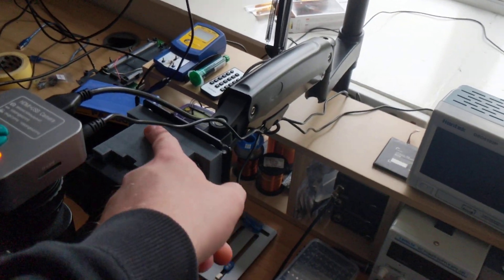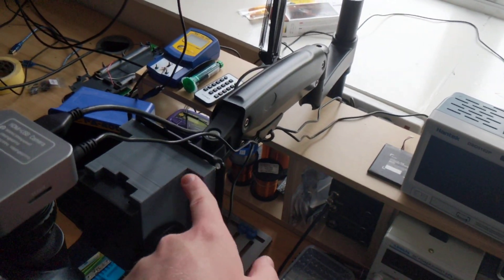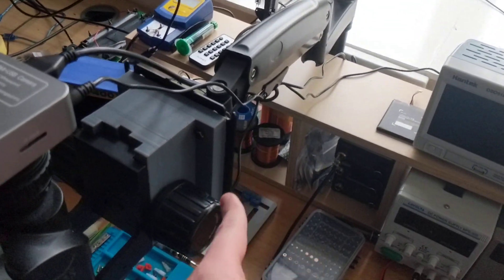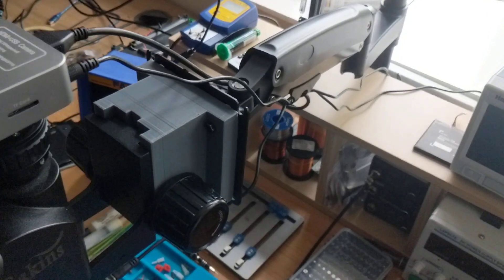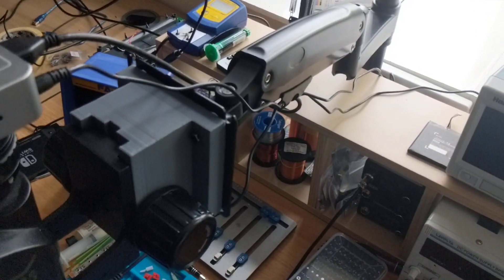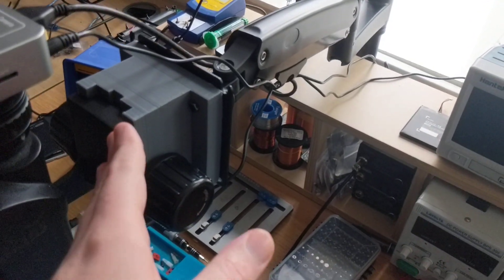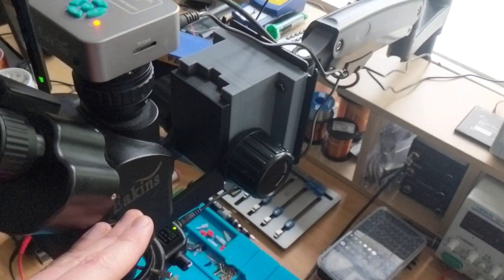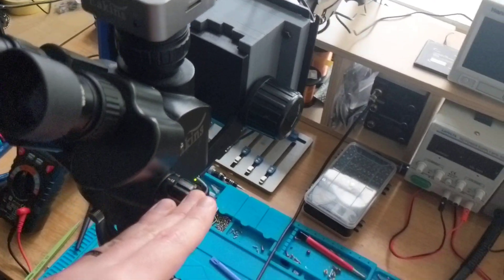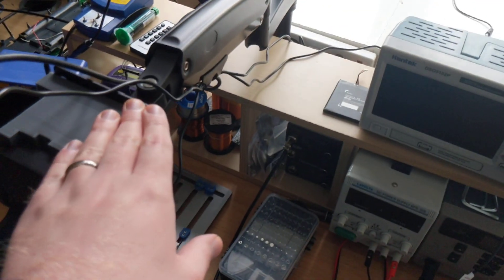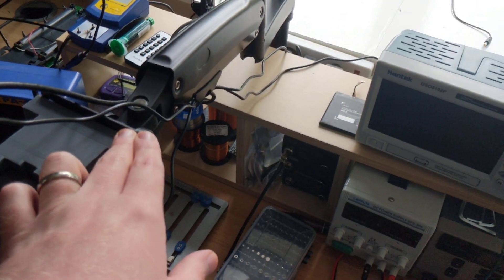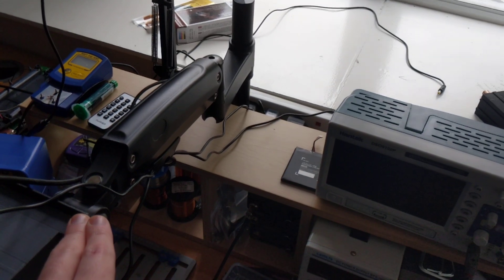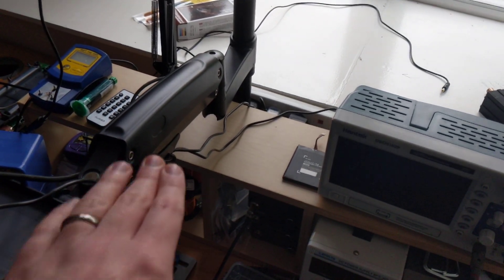This right here is a VESA 75 mounting bracket that I have developed to allow an Amscope or Eakins, which is an Amscope clone microscope, to mount to a standard VESA 75 LCD monitor arm.